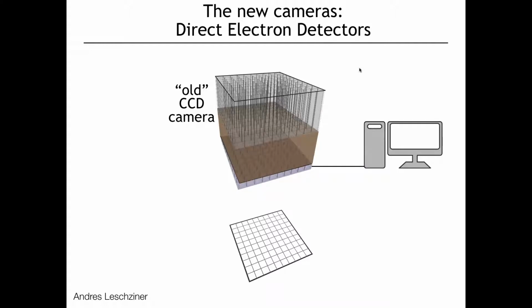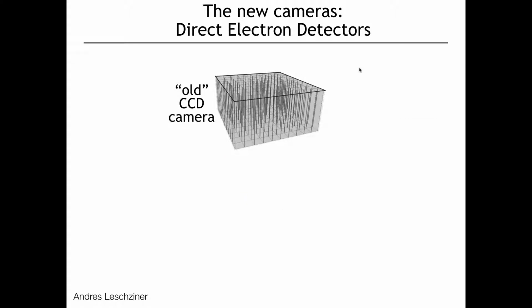All right, so these are the old CCD cameras.